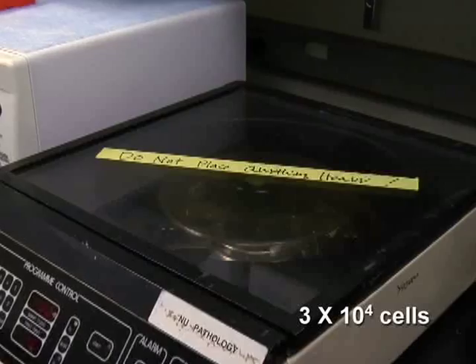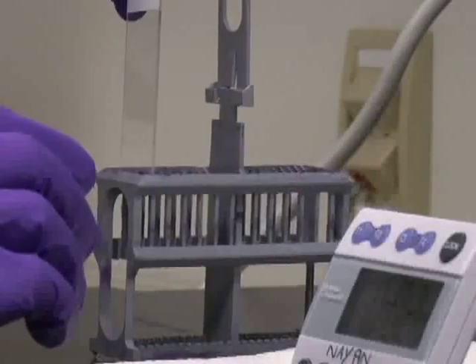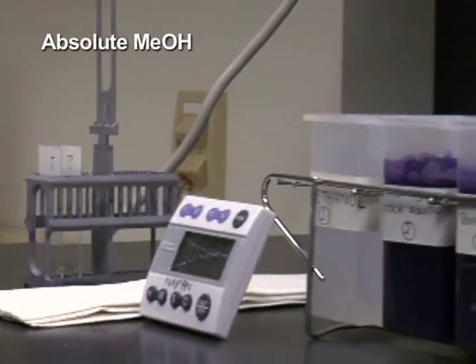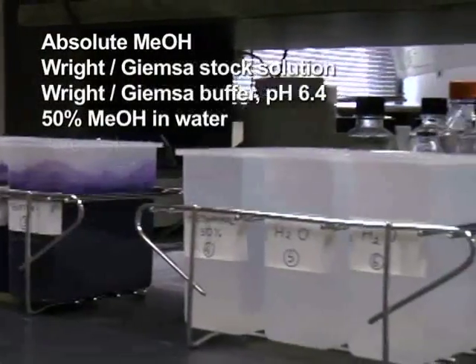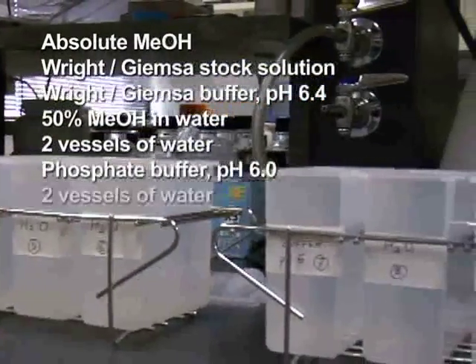Air-dry the slides overnight. To efficiently stain the slides, set up an assembly line of 9 staining vessels containing solutions in the following order: absolute methanol, Wright-Giemsa stock solution, Wright-Giemsa buffer, 50% methanol in water, two vessels of water, phosphate buffer pH 6, and finally two vessels of water.